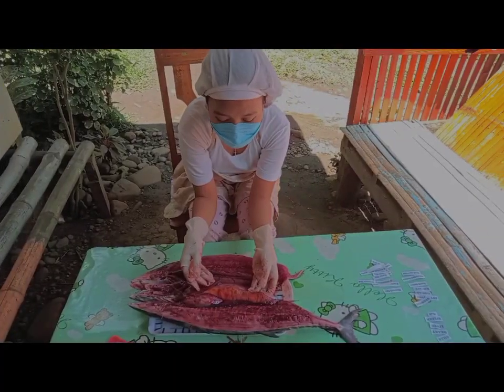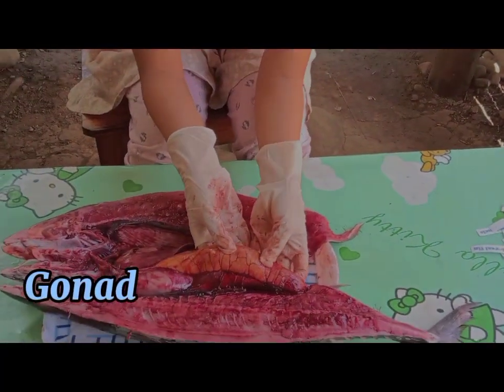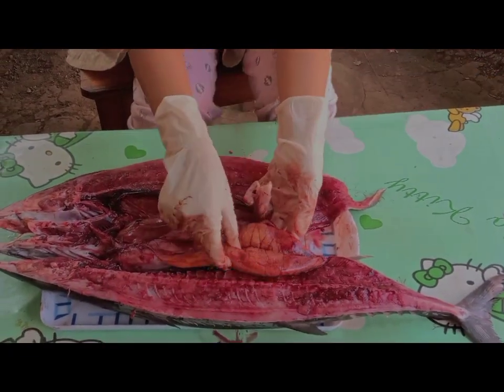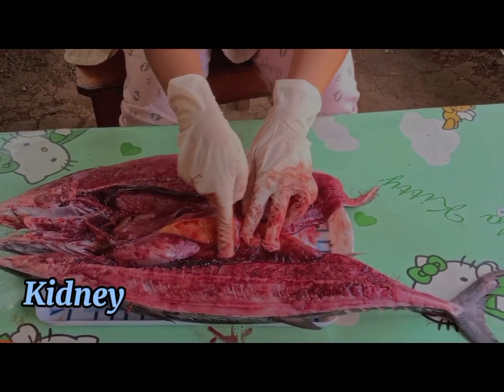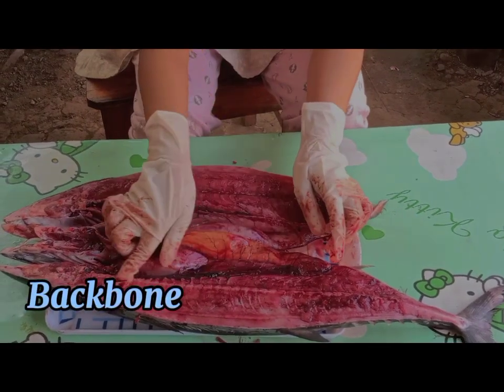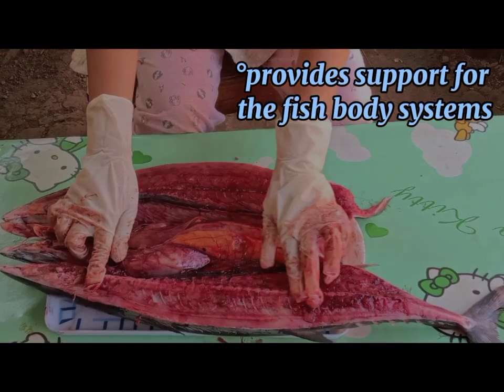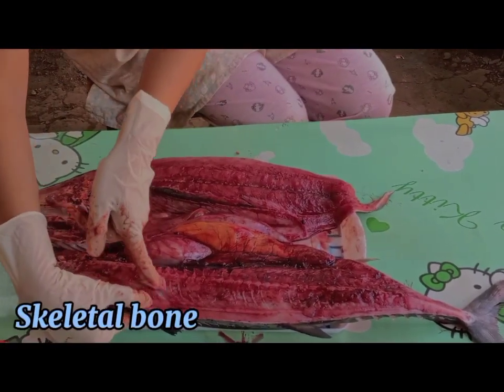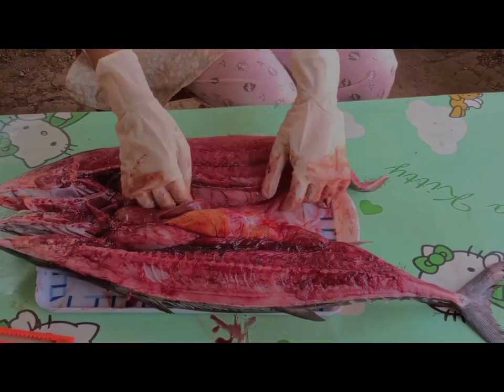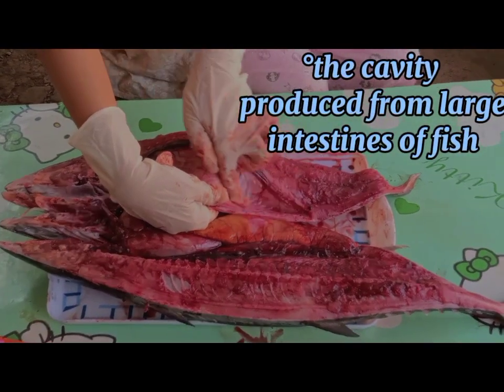As we can see, this is a female Bangkulisan because it has a gonad — this is the gonad. And next, the kidney. The backbone of the fish. The skeletal — this is the skeletal bone. Next, the gut cavity — this is the gut cavity.